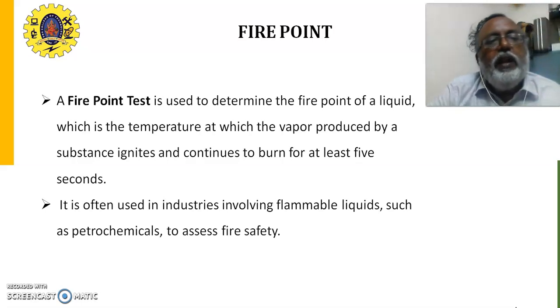A fire point test is used to determine the fire point of a liquid, which is the temperature at which the vapor produced by a substance ignites and continues to burn for at least 5 seconds. So, it is the point at which a fuel can burn for at least 5 seconds.